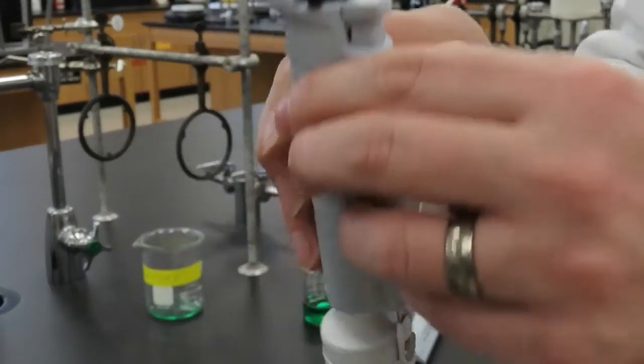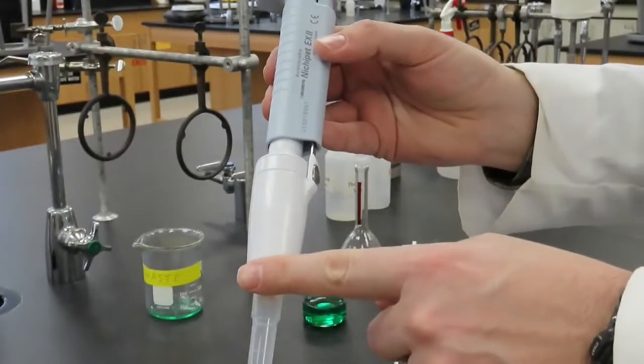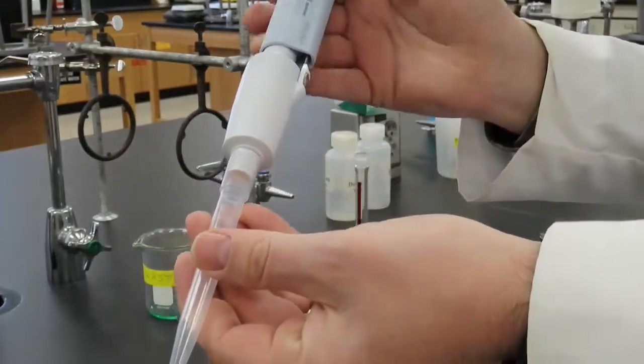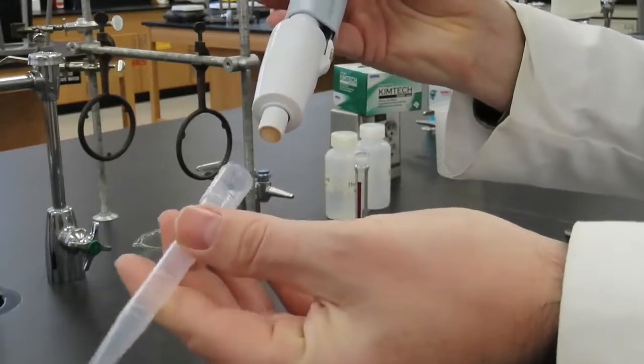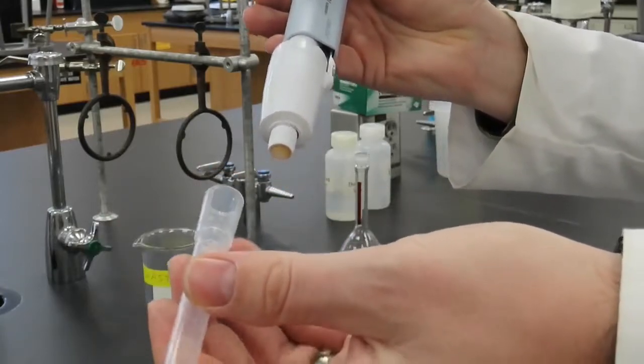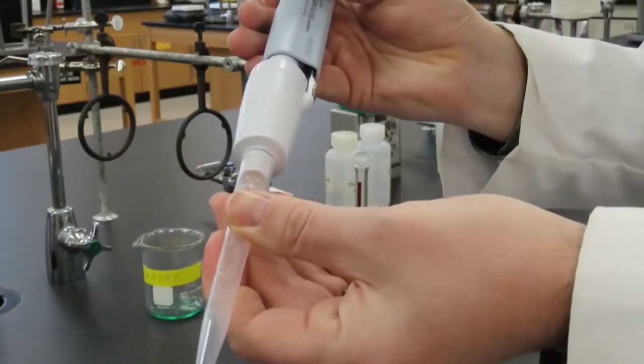Below the plunger is the micropipette shaft, and at the end is a removable and disposable tip. The tip size matches the micropipette size. The tip should fit comfortably onto the bottom of the shaft.